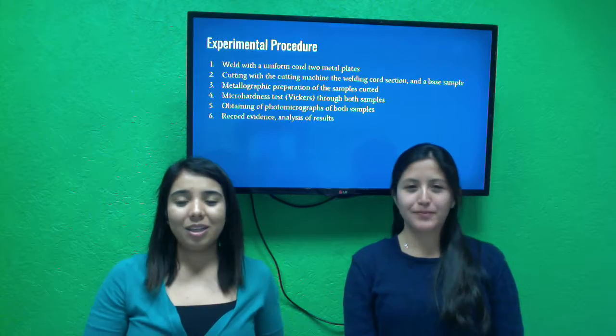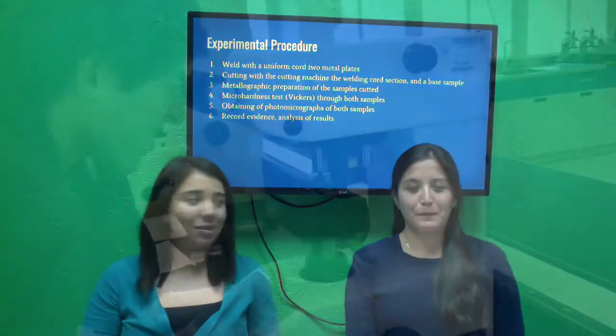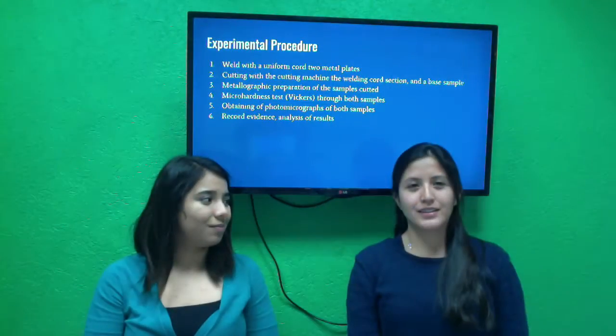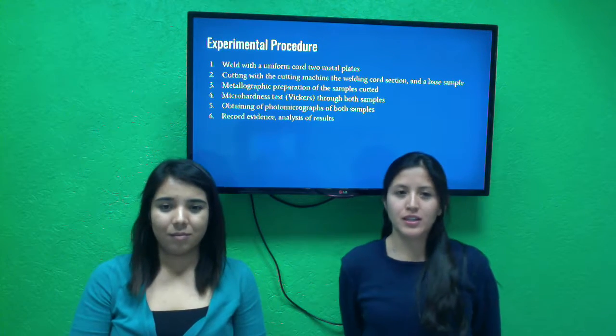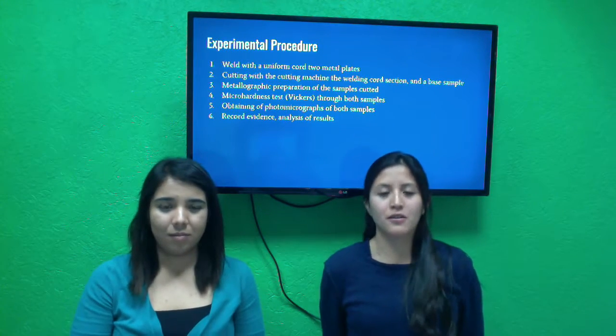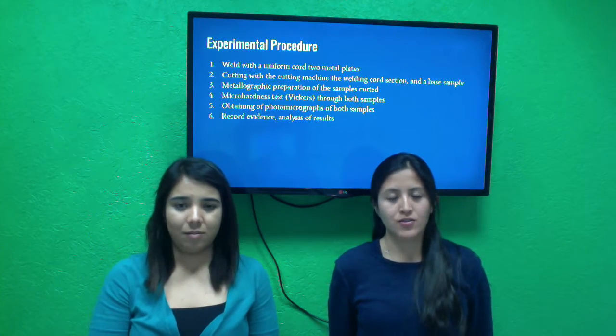After, we did the Vickers hardness test in both samples. And then we made the chemical attack in order to look at the grains of both samples in a microscope at different magnifications.